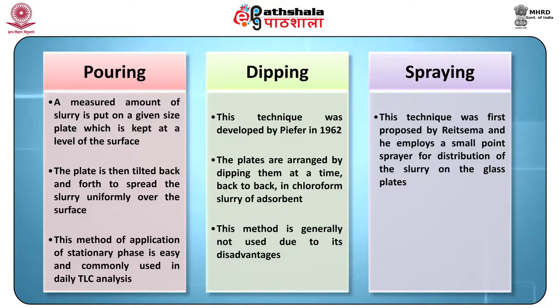Spraying. This technique was first proposed by Reitsema and employs a small point sprayer for the distribution of slurry on the glass plates. Nowadays, ready-to-use pre-coated TLC plates are available commercially. However, these are quite expensive.